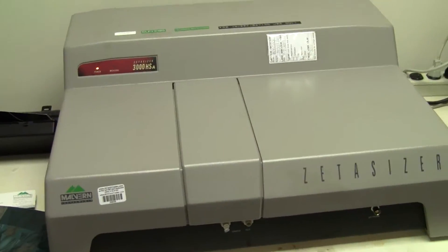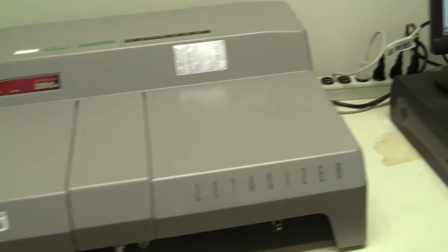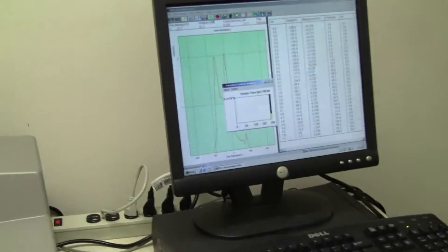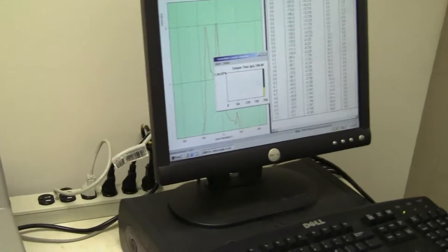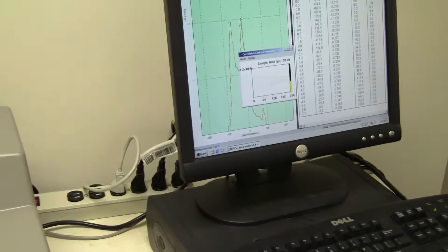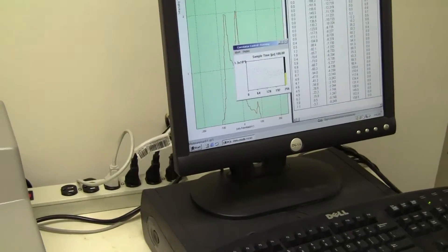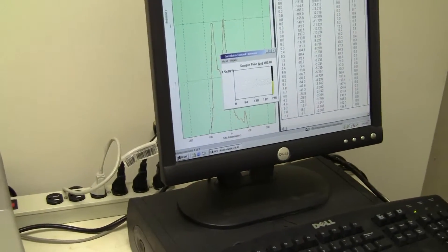Hi, this is Michael Natow from High Tech Trader. Today we're looking at a Zetasizer 3000 HSA made by Malvern Instruments.